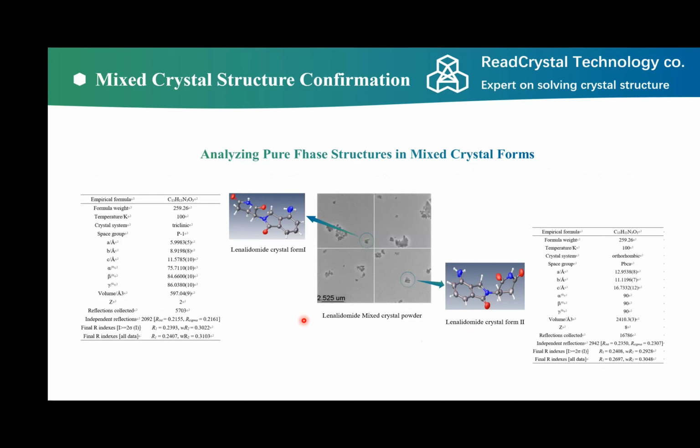It's also quite straightforward. In the TEM, we just select different crystals and solve the structures separately. Then you would understand which particle corresponds to which structure.